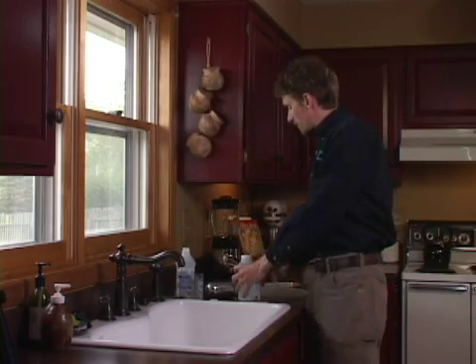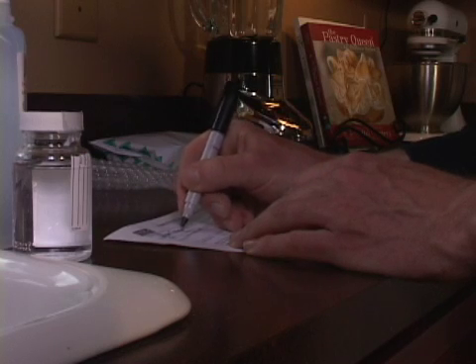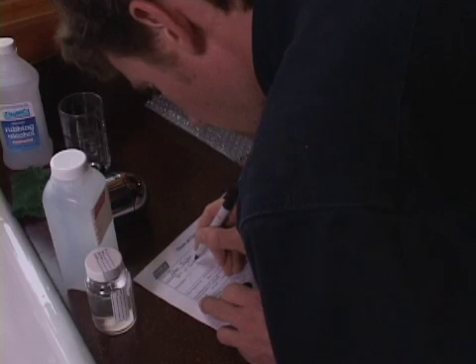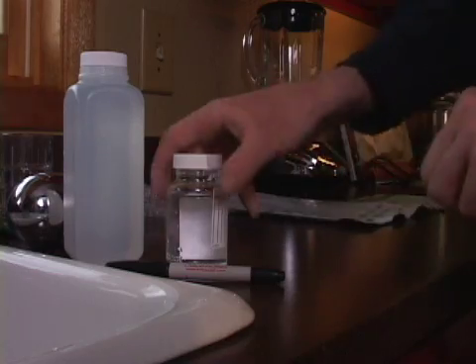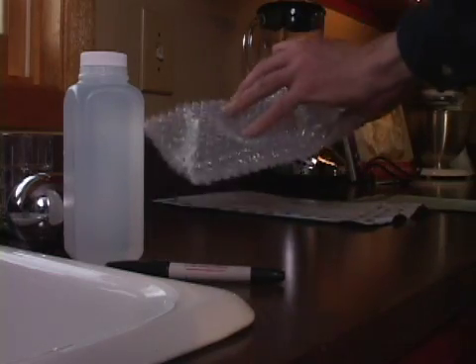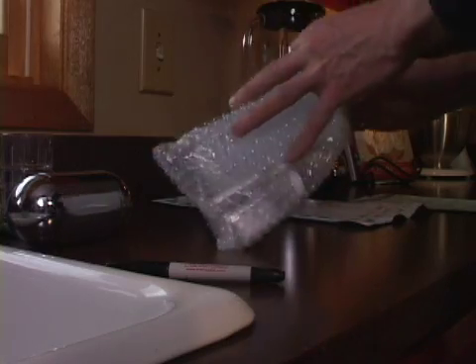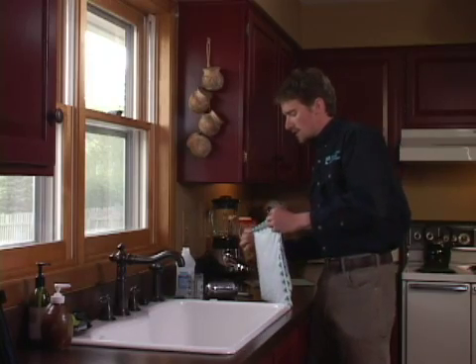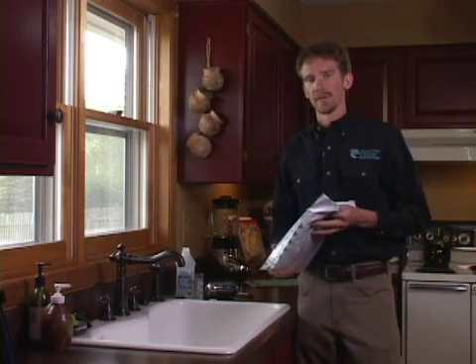Now I'm going to fill out the paperwork the lab sent me. This paperwork includes information about the samples, what I want the lab to test for, my name, contact information, date and time, and possibly other information. Once finished, I replace the paperwork and sample bottles in the mailing envelope, seal it, and head to the post office to mail the samples.